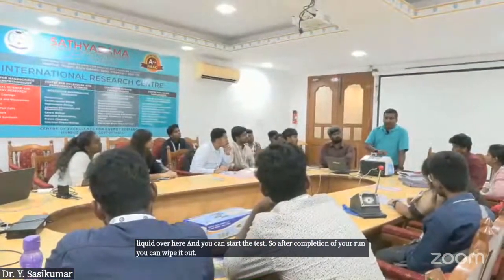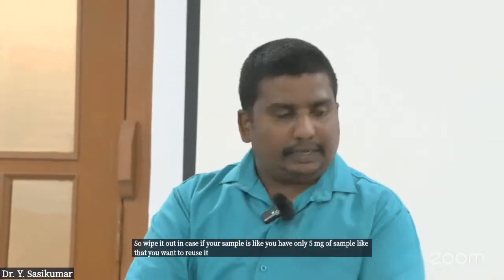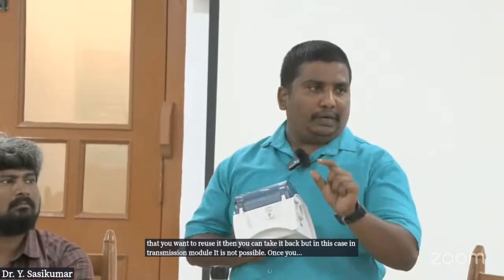Wipe it out, in case you have only 5 mg of sample and want to reuse it, then you can take it back. But in the transmission module, it is not possible. Once you prepare your sample with KBr, it's like a small tablet-like structure, a pellet. Once you prepare it, that's it. It's a waste.